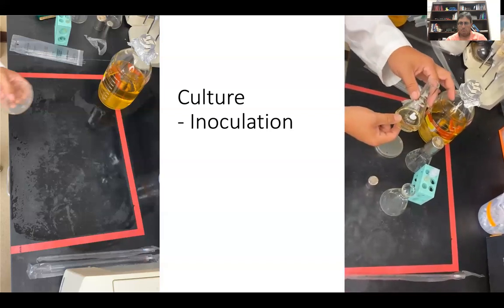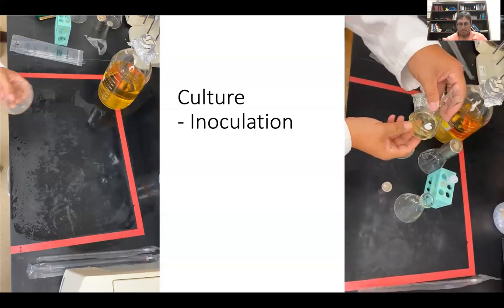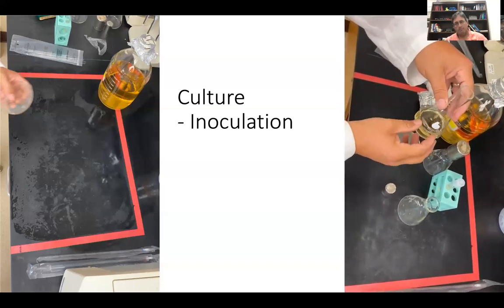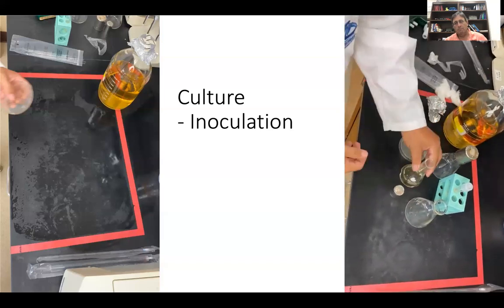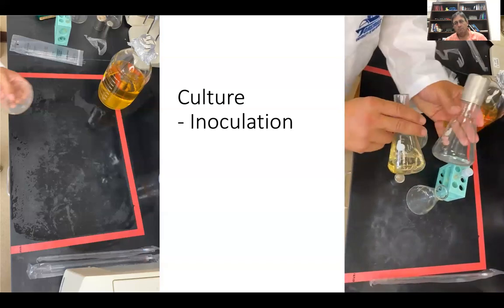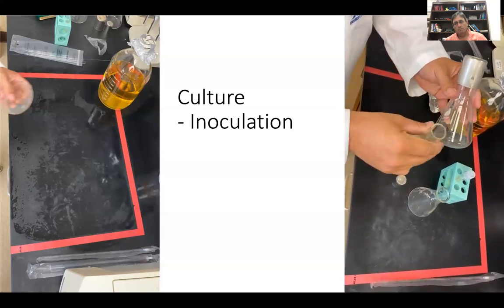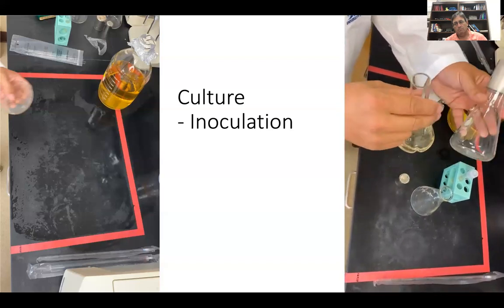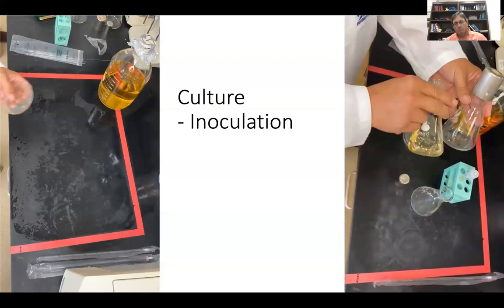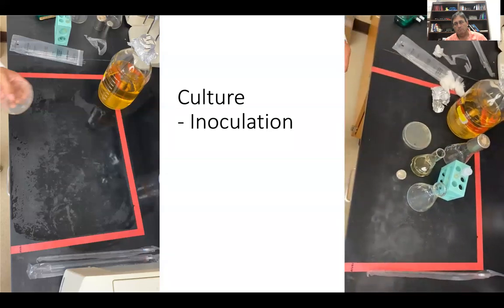Notice we take a very small total volume of this because it's going to shake. We want this to shake nicely so it can get aerated, but not so filled that it will overspill. Both of these flasks work fine. The difference is these baffles here help keep the bacteria culture in suspension a little bit better than this. Both will work. If you have tough growing cultures, sometimes the specialized baffled flasks are better to use.